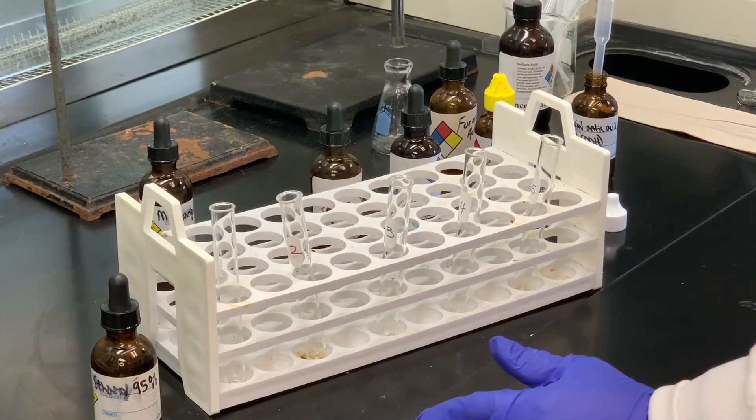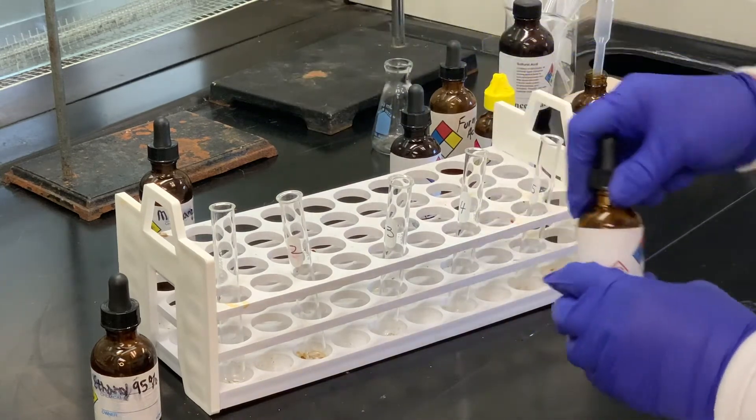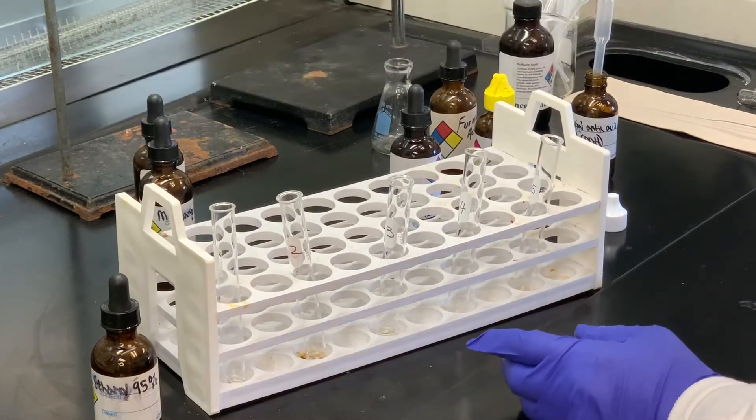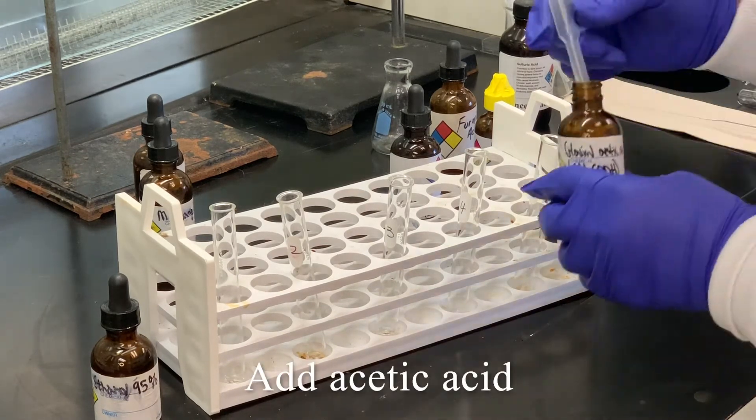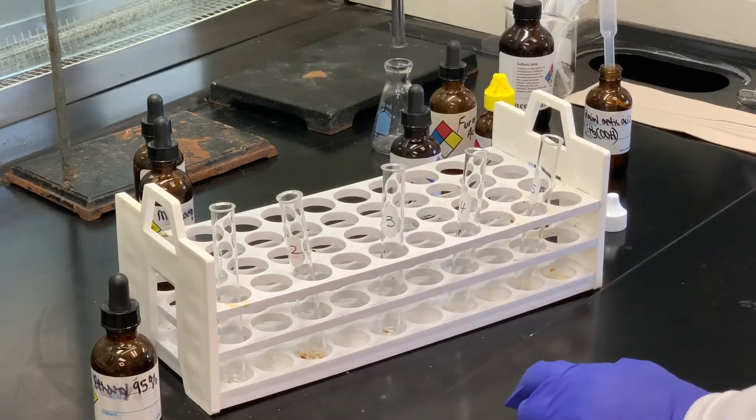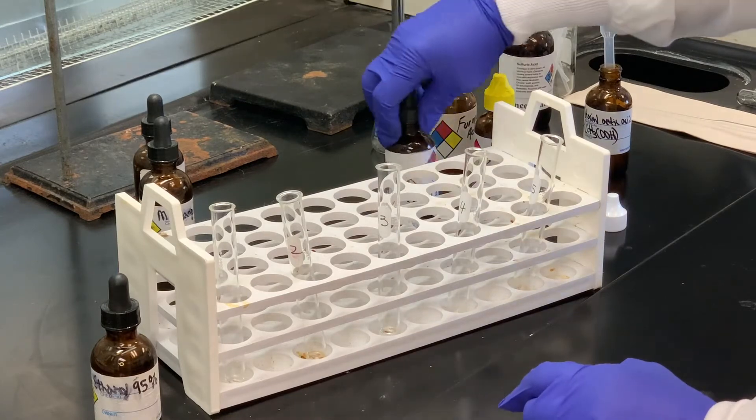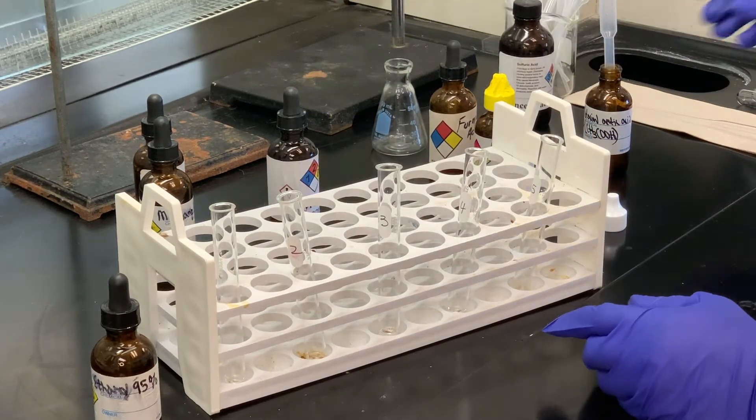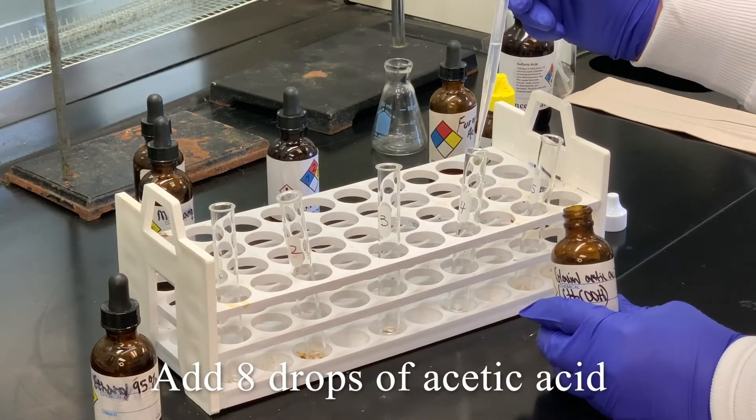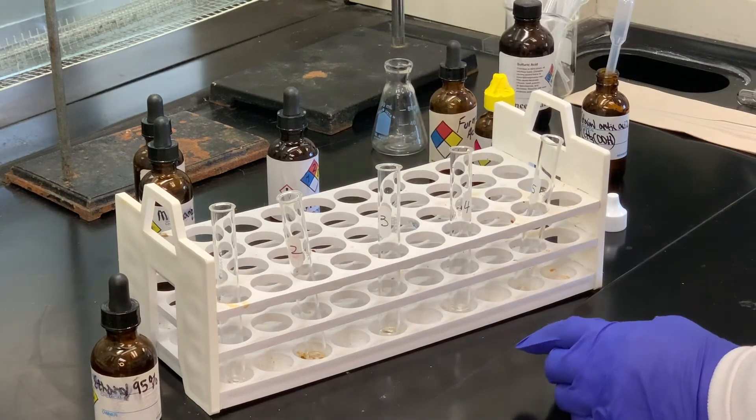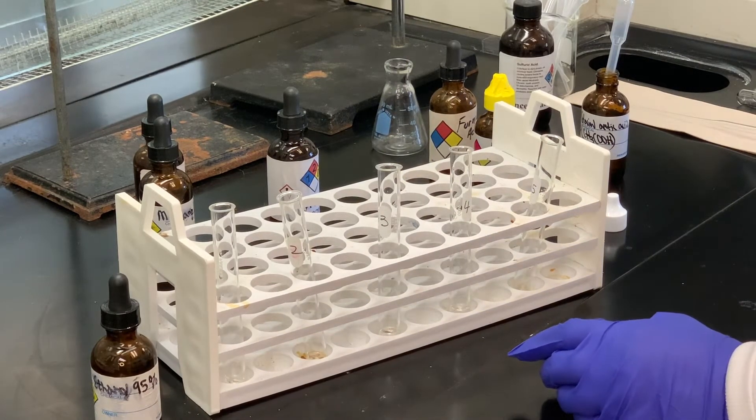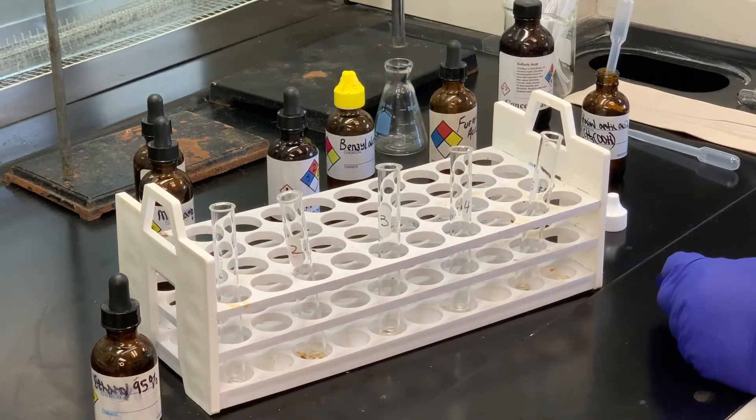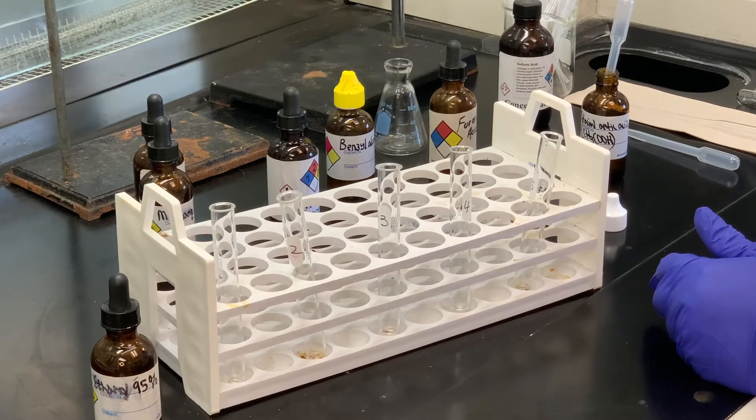In the third test tube, we're using 20 drops of isoamyl alcohol. And to that, we're going to add 10 drops of acetic acid. In the fourth test tube, we're going to use 20 drops of octyl alcohol and also 8 drops of acetic acid. And in the last test tube, we're going to use 9 drops of benzyl alcohol. And to that, we're going to add 10 drops of formic acid.